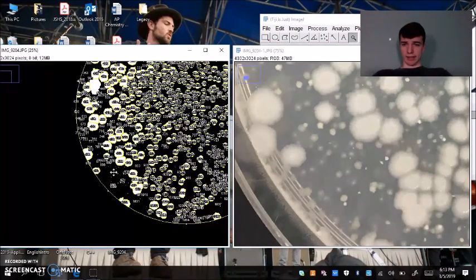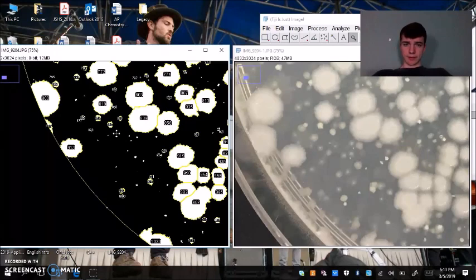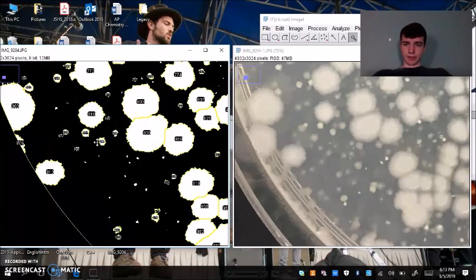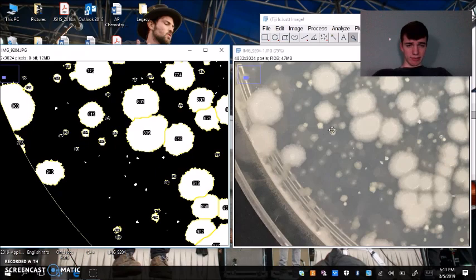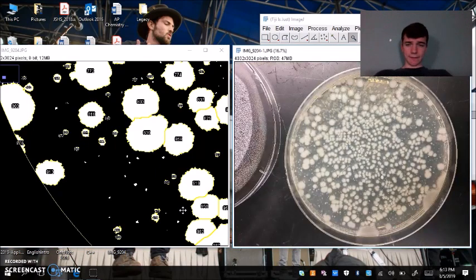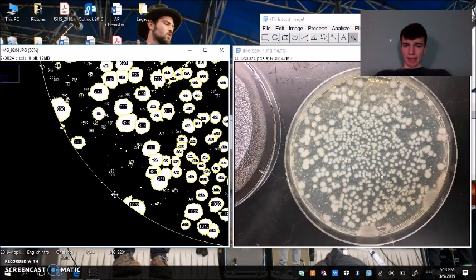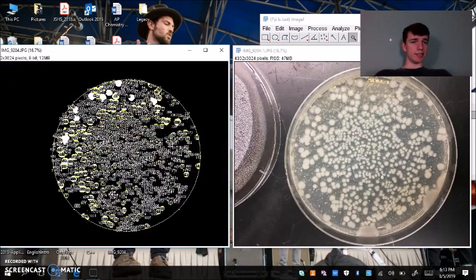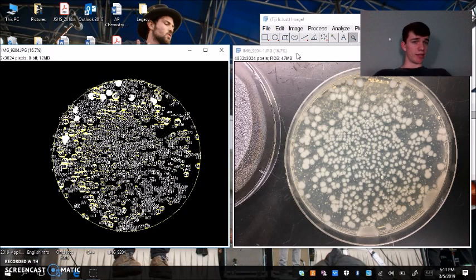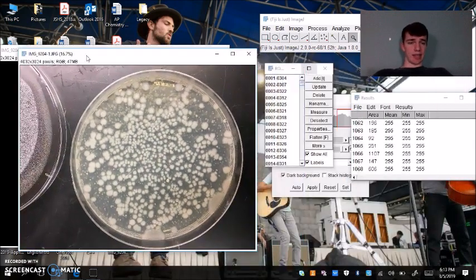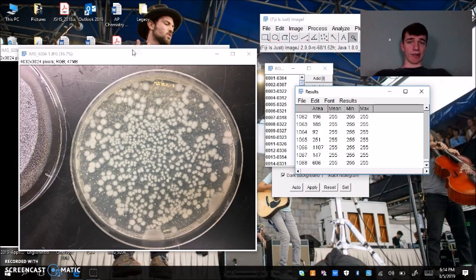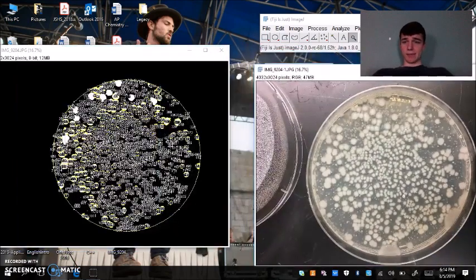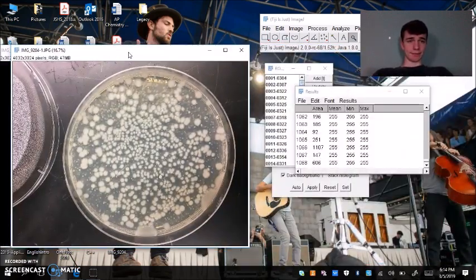I could say, okay, do I want this one to be counted? That corresponds with this one right there. I could say, okay, that counts as a colony. It's just up to you at this point to decide if you're okay with how the analysis was done. And if you think that this number, 1,068, is an accurate representation of how many colonies that you've had.